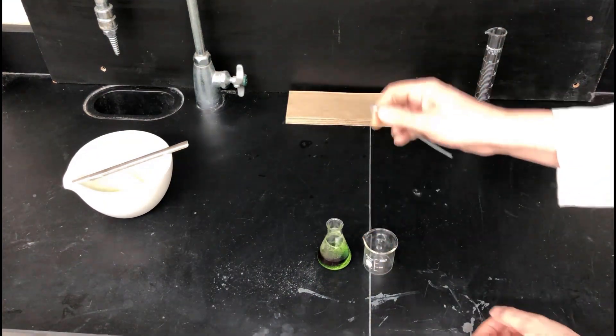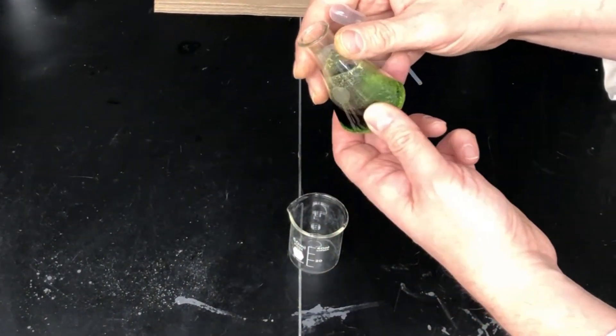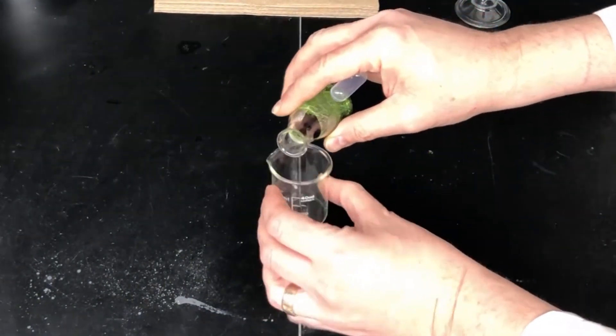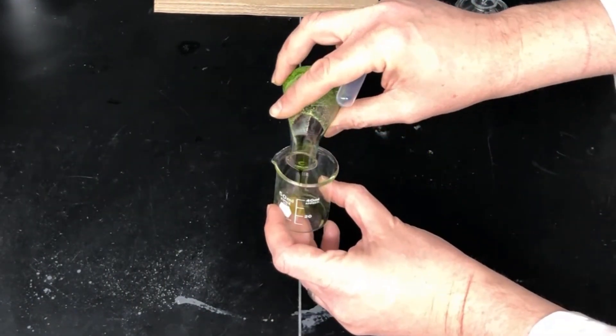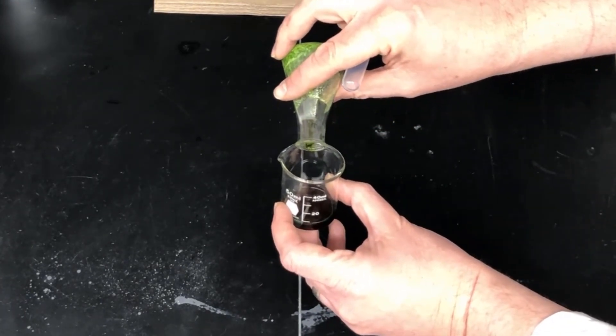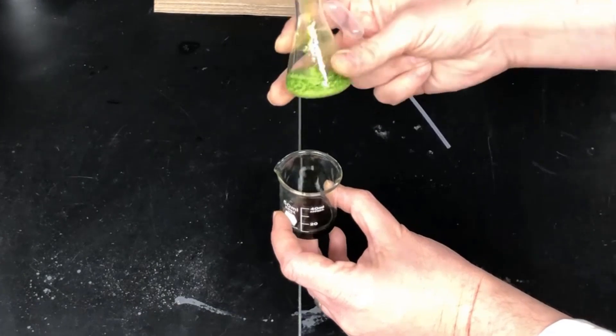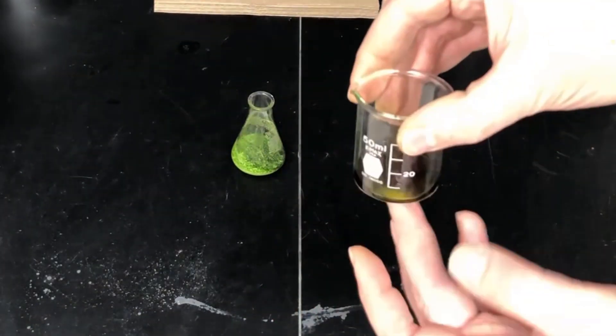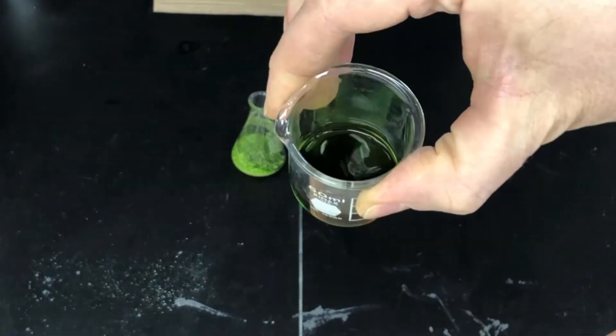So the next thing we're going to do then is decant off that dark green solution to get it by itself and leave the solid stuff behind. So there's the decanting process. It's just pouring carefully such that you leave the solid material behind. So there we go. That's the pigment solution that we're after.